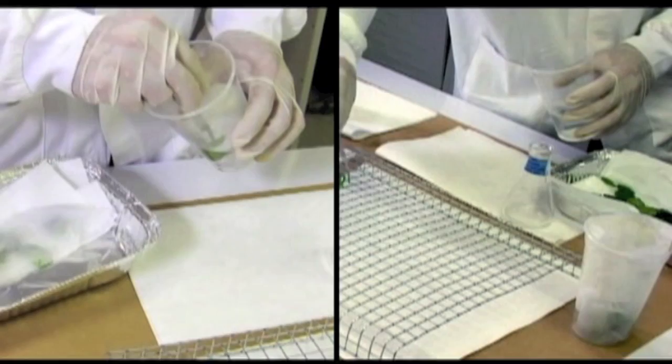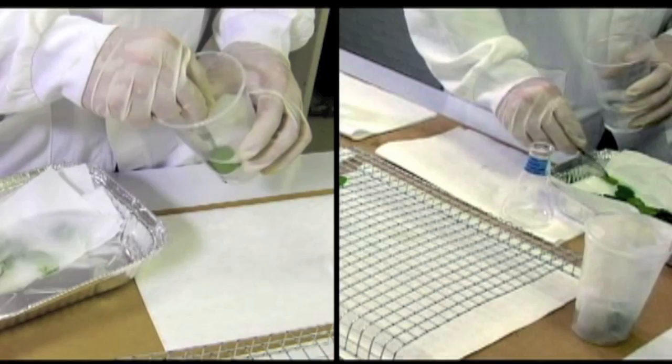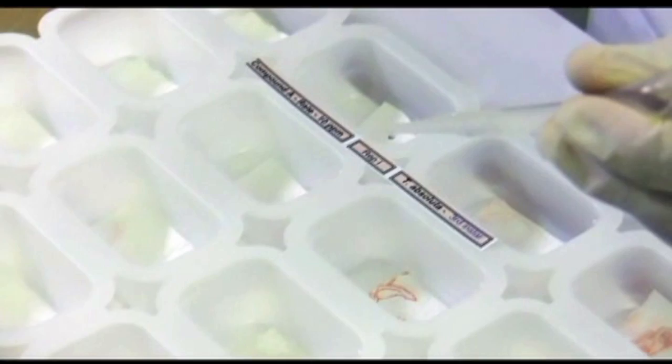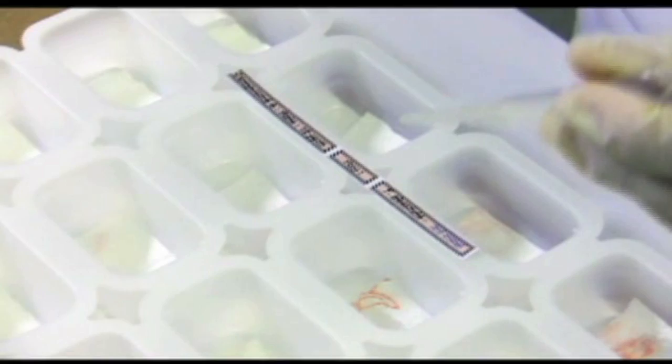Leaf discs should be treated one by one, then placed to dry on the wire mesh tray with their upper surface facing up. This must be done in a well-ventilated room so that the leaves dry as fast as possible. Trays should be marked with labels according to the treatments they will be assigned to.